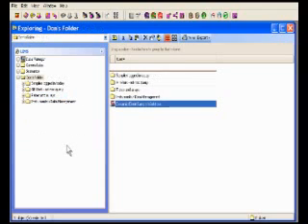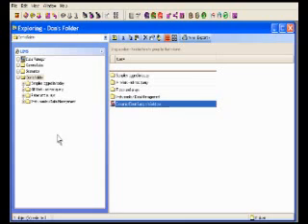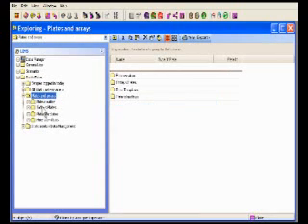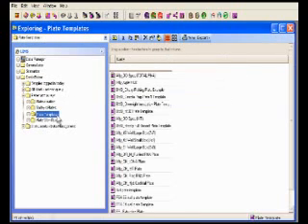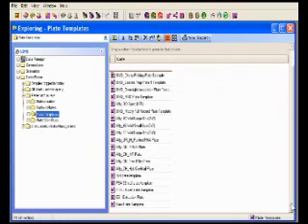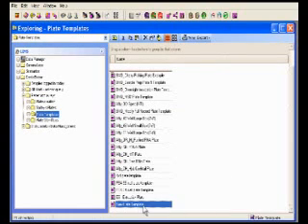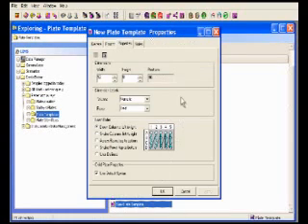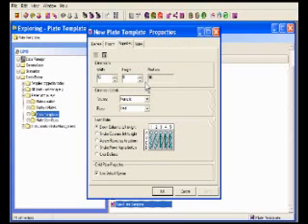Today's labs may run thousands of samples at a time, demanding automation capabilities that significantly increase sample throughput. Nautilus' plate template utility simplifies the configuration of plates and fill patterns by allowing users to enter dimensions for all plates, boxes, and microarrays, as well as add labels and define load orders.